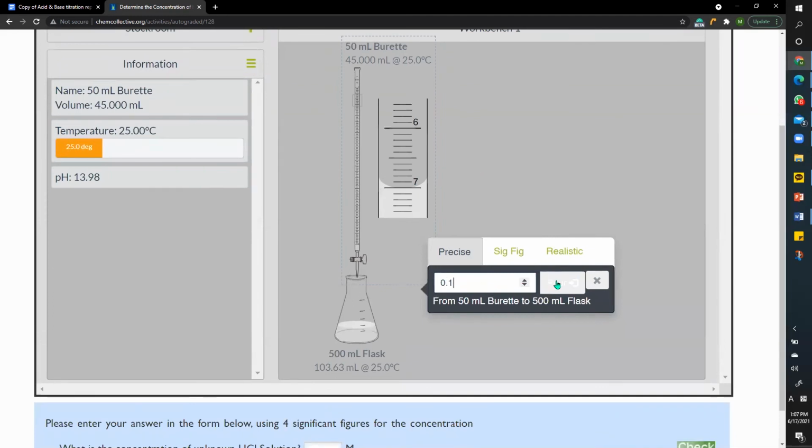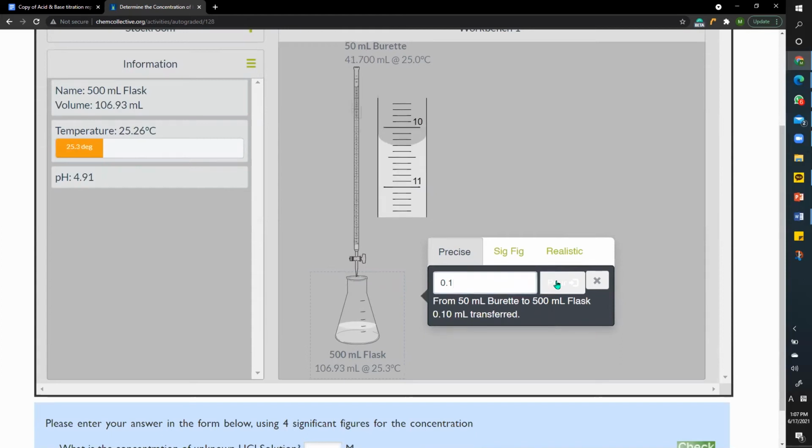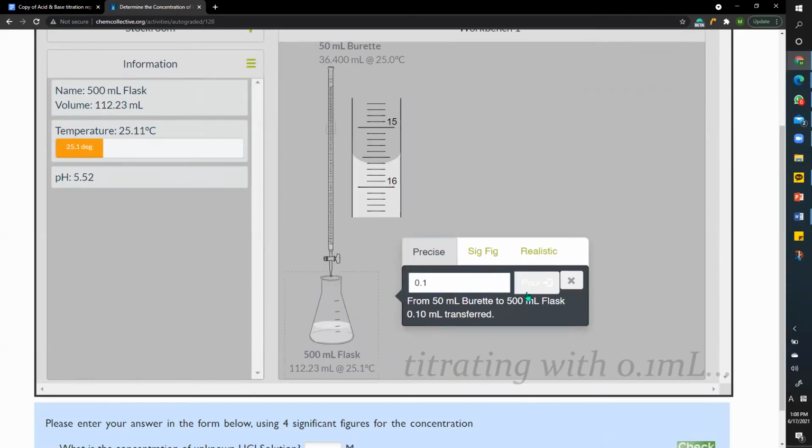0.1. Now I'll concentrate in here. Oh, look.